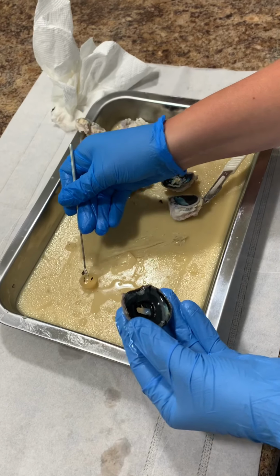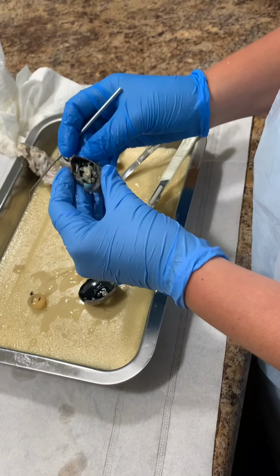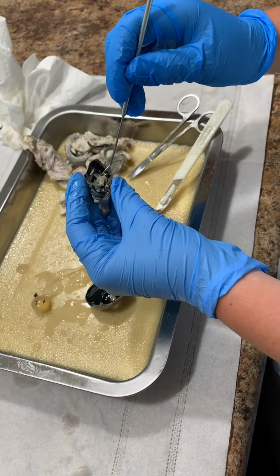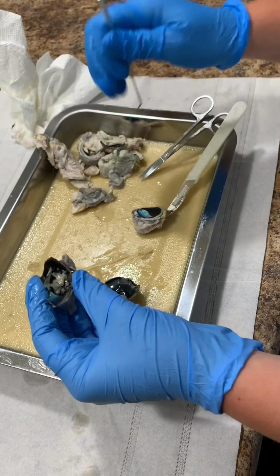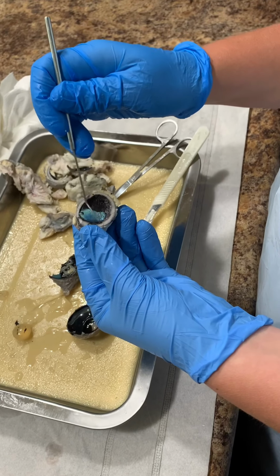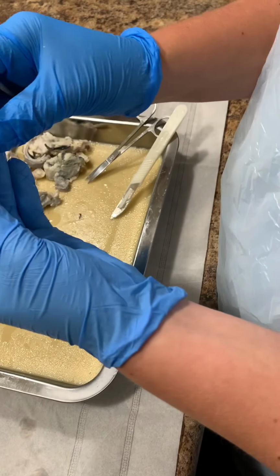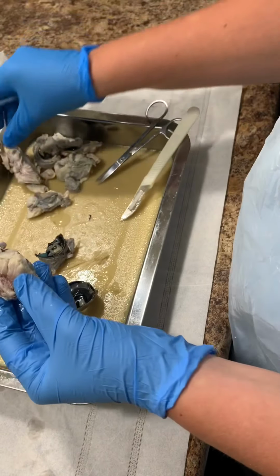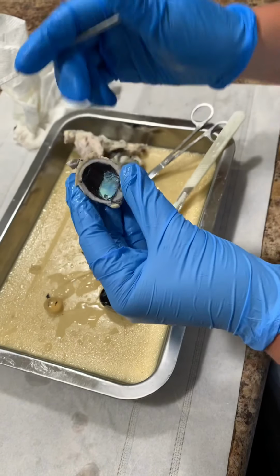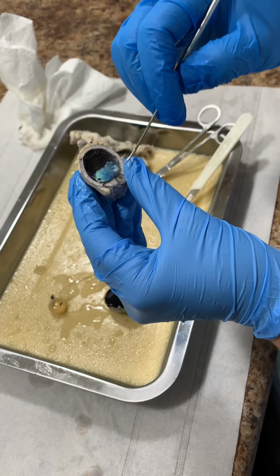This is the lens. On the back of the eye, I accidentally messed it up, but that's okay. We can still see it. This cloudy piece right here is our retina. The choroid is the black layer on the back of the eye. This really pretty thing is what helps the cows see at night. And we can see a lot more clearly on here. My eye had a lot of fat and tissue. So this is the muscle, and this hard white thing is the sclera, which surrounds the entire eye.